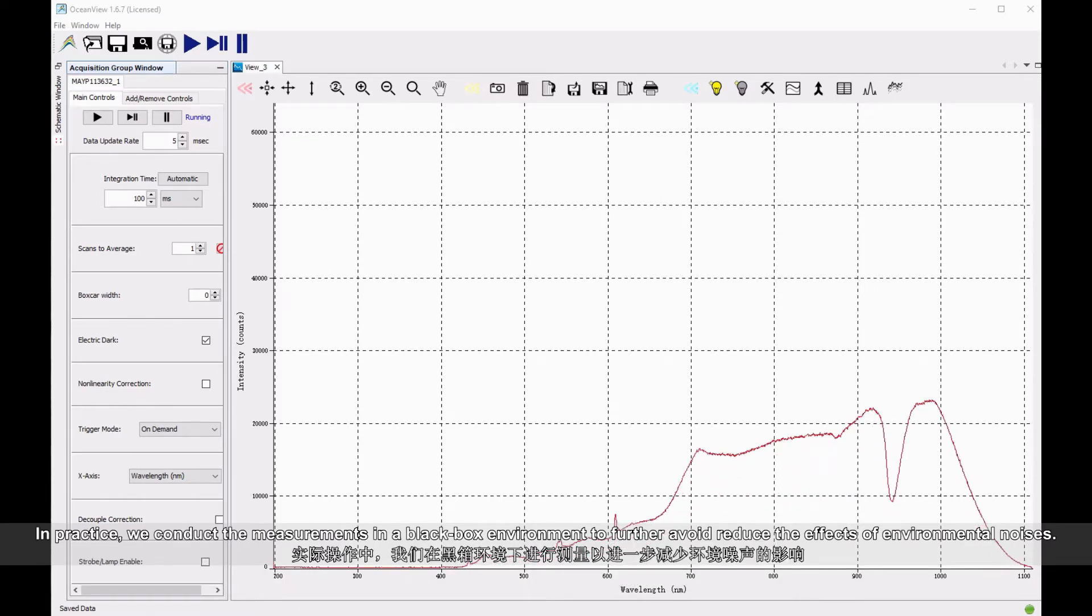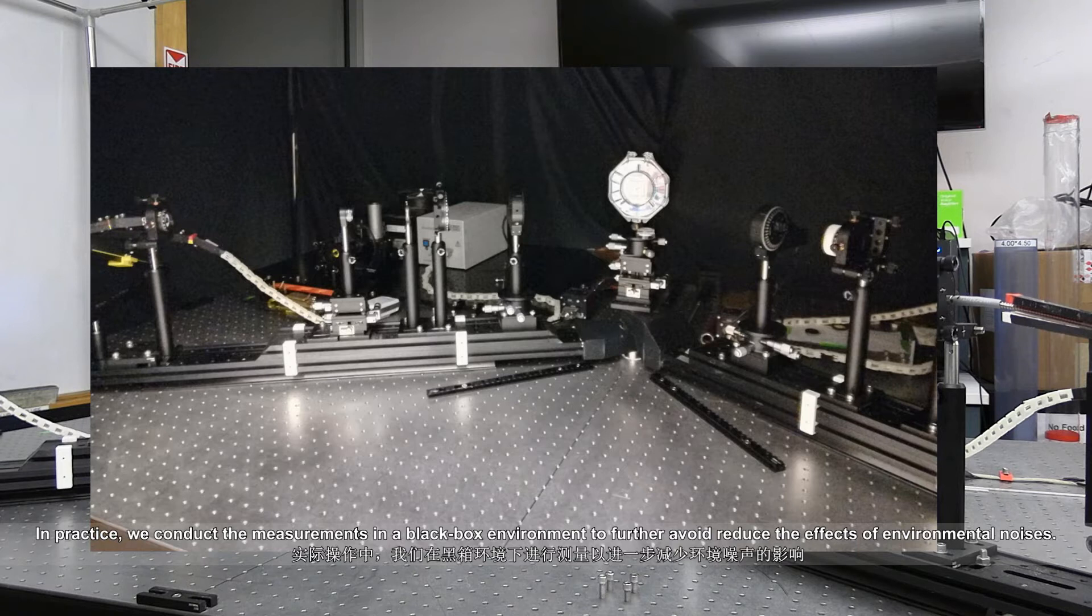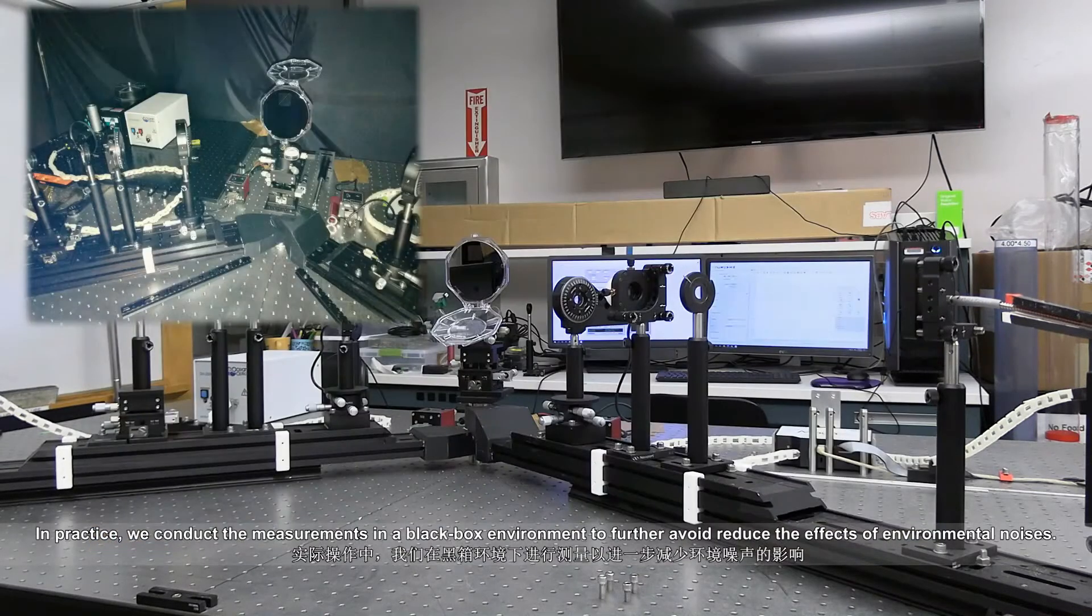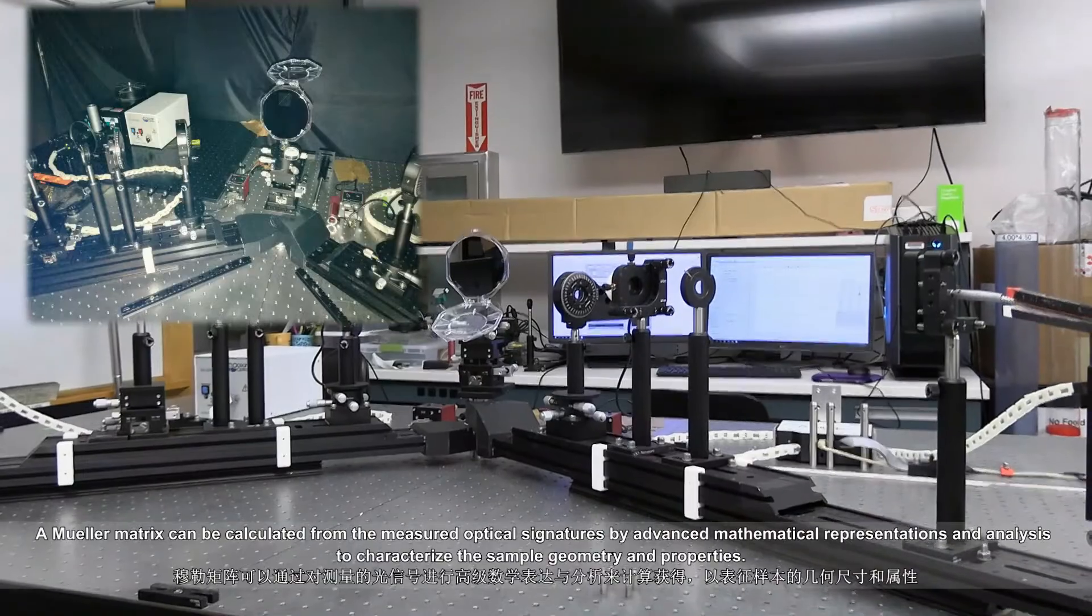In practice, we conduct the measurements in a black box environment to further reduce the effects of environmental noises.